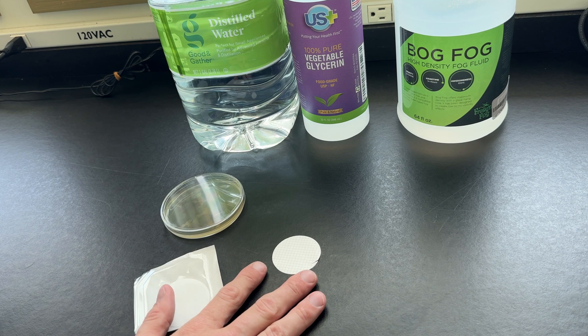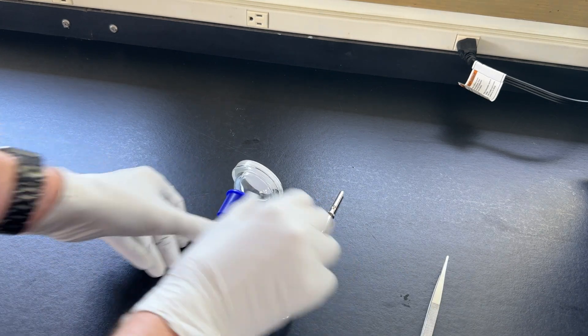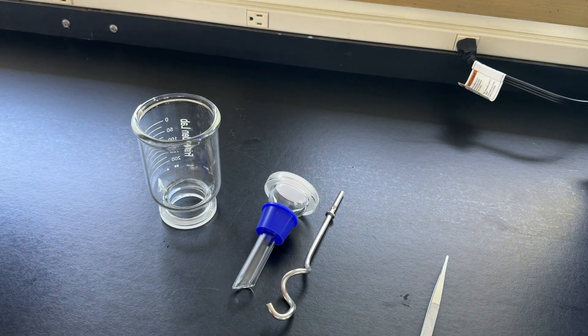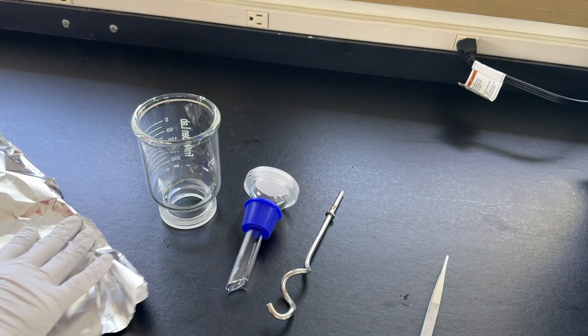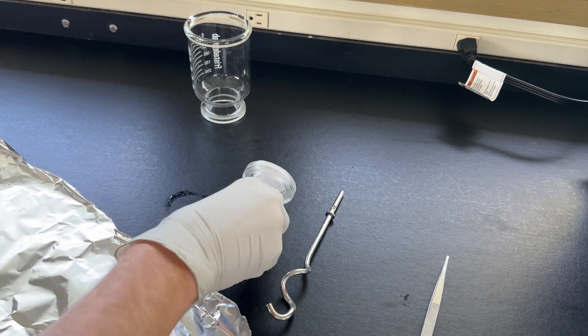Let's get started sterilizing some of our instruments. One of the things I'm trying to do is keep bacterial contamination at a minimum, so I need to sterilize some of the stuff I'm working with. I do that by first wrapping these in aluminum foil, because after sterilization I don't want them contaminated with the air.